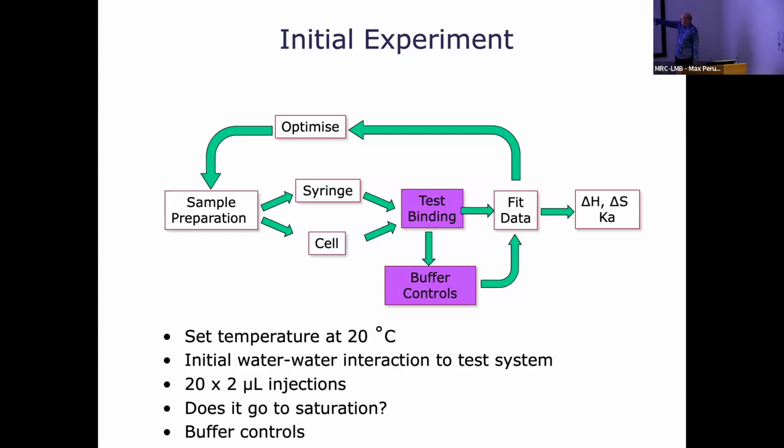Then typically in the injections, we do about 20 injections with 2 microliters. And the questions you have to ask yourself are, does it go to saturation? And what buffer controls do you actually need?